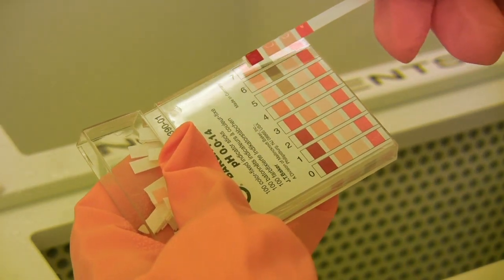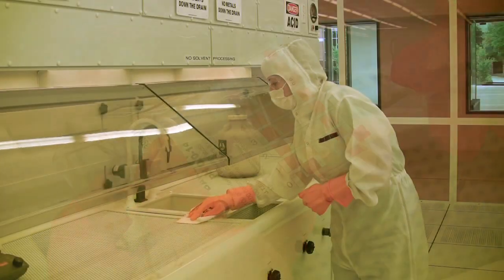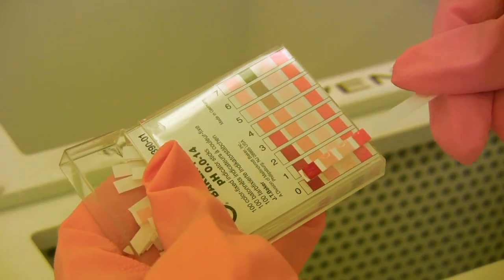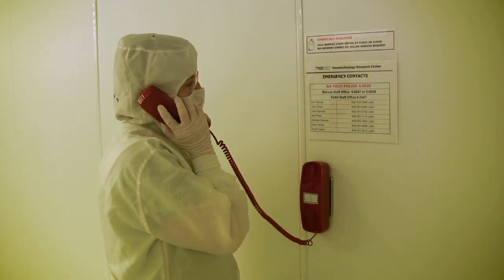If you find that the liquid has a pH of 7, or is a very small amount of something with a high or low pH, you may wipe it up with tech wipes and dispose of them in a nearby trash can with your acid gloves still on. If there happens to be a large amount of liquid with a high or low pH, you should immediately notify the cleanroom staff.